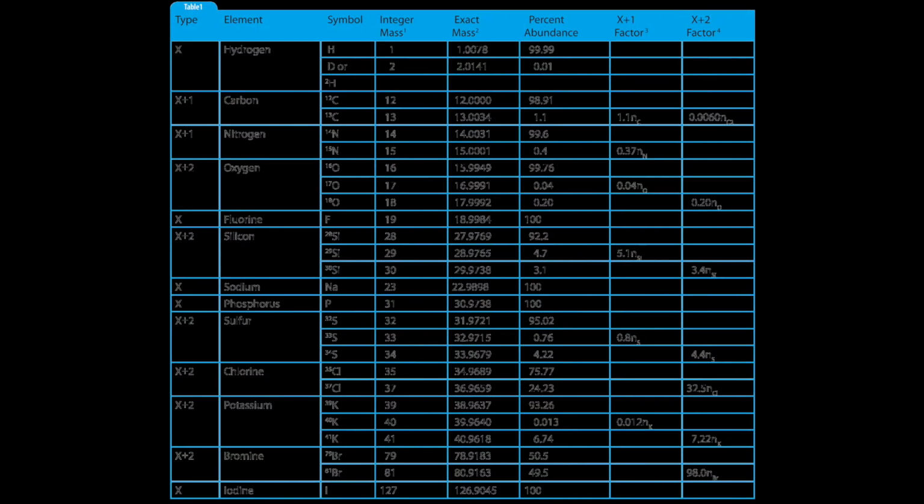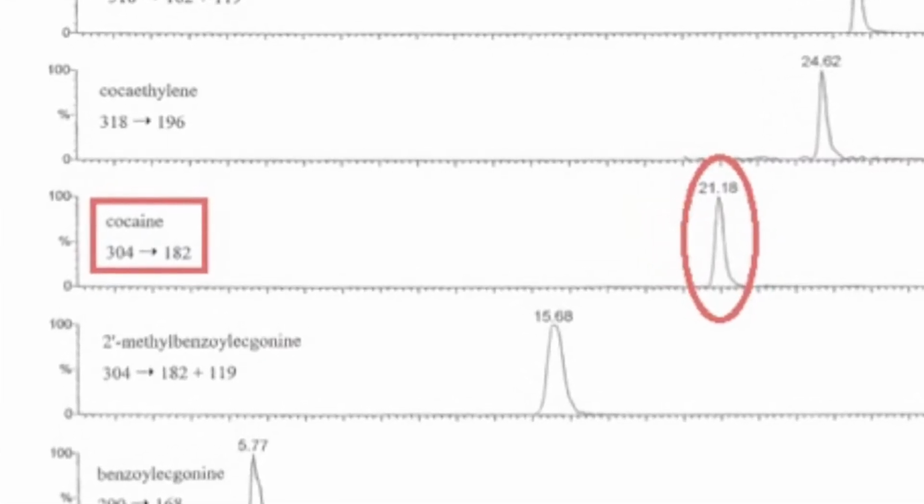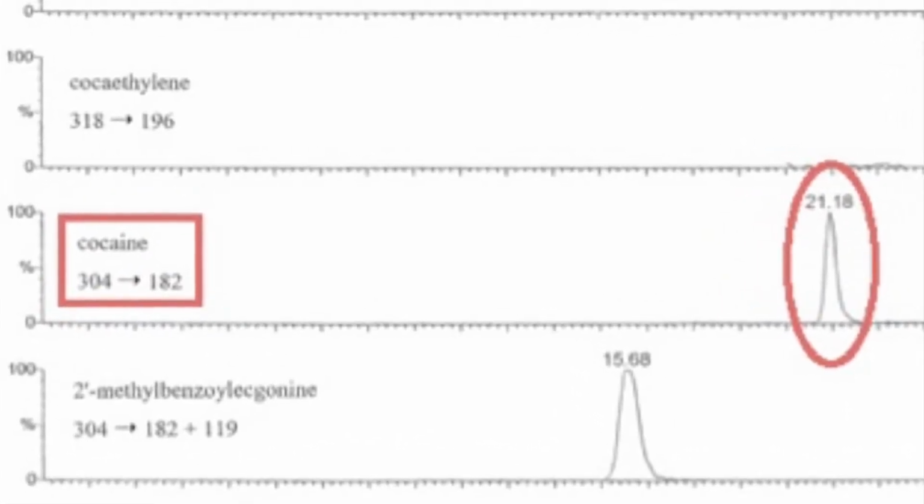Scientists have already taken the mass-to-charge ratio of almost all the elements on Earth. Based on these pre-recorded numbers, you can quickly determine the identity of all the ions in the sample that you are analyzing. This is useful as you can see the percent of a sample that is comprised of a particular element based on these relative abundance readings from the mass spectrometer.